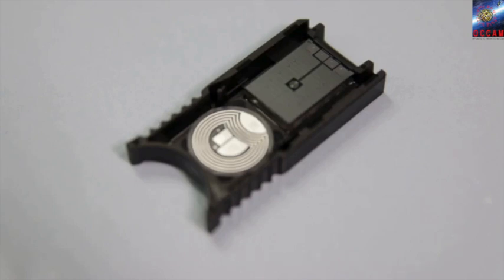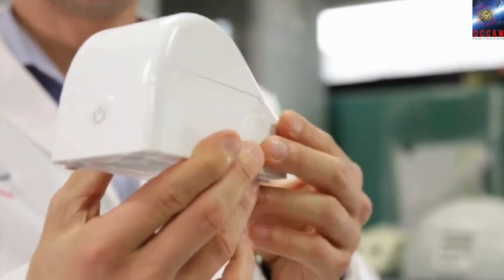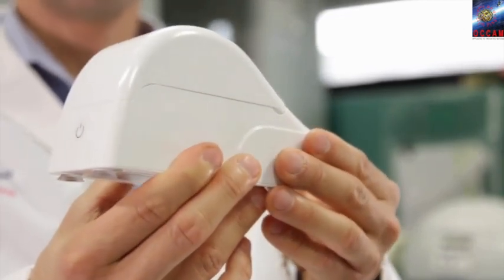Since qPCR requires precise heating and cooling cycles, the cartridge is built around a silicon chip which integrates a miniaturized heater and temperature sensor. The chip is produced according to microelectronic standards that guarantee a high quality level. The Q3 instrument is far smaller than traditional qPCR equipment. It drives the chip and features a compact fluorescence microscope to measure the optical signals coming from the reactions.